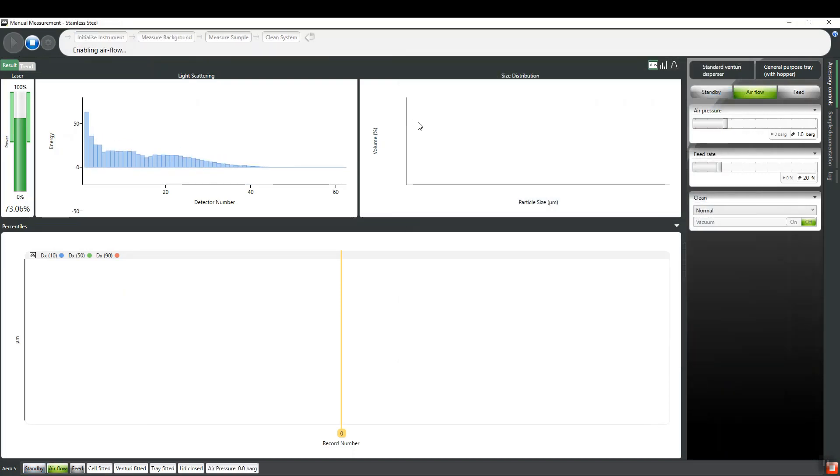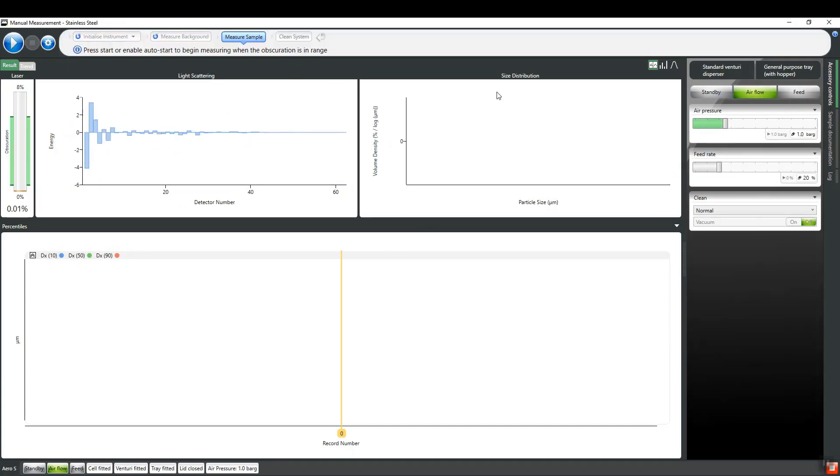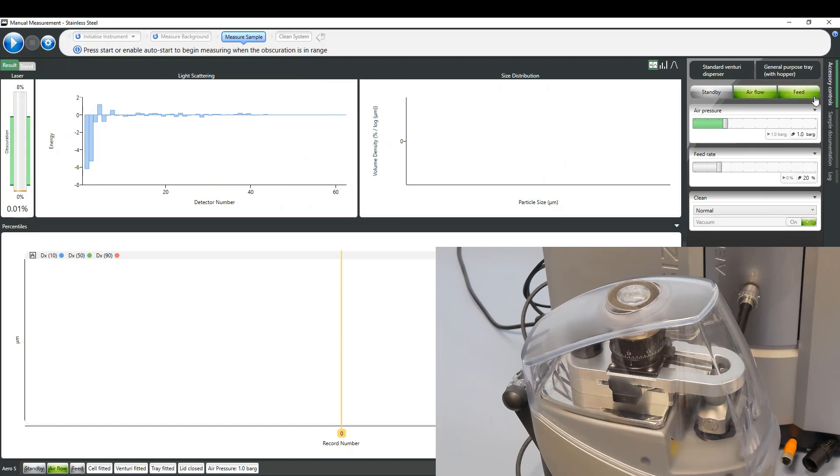Once all done, the measurement process can be initiated, first proceeding with automatic alignment and background measurements. The feed can then be started, and the measurements begin once the obscuration arrives in a defined range.